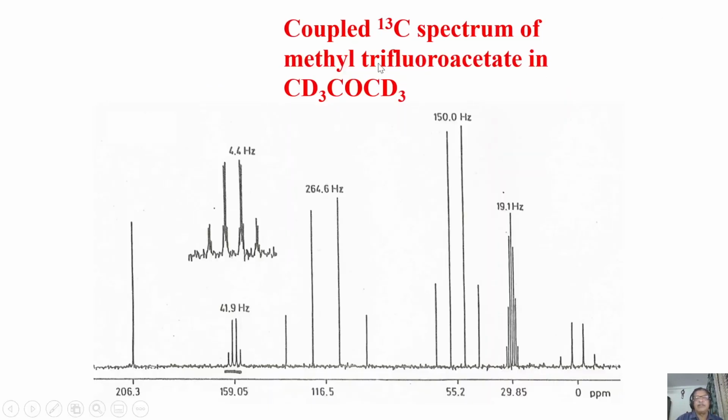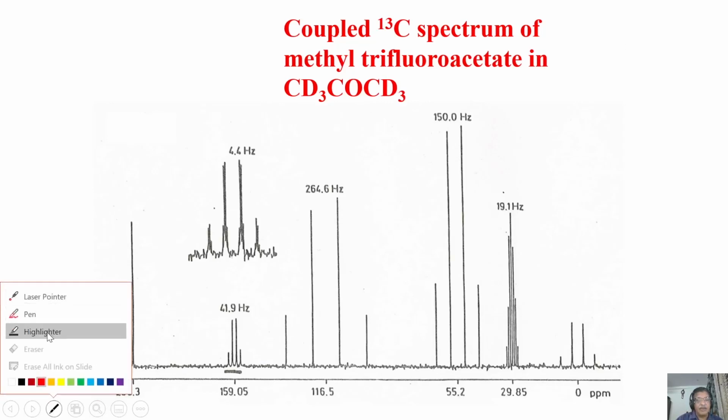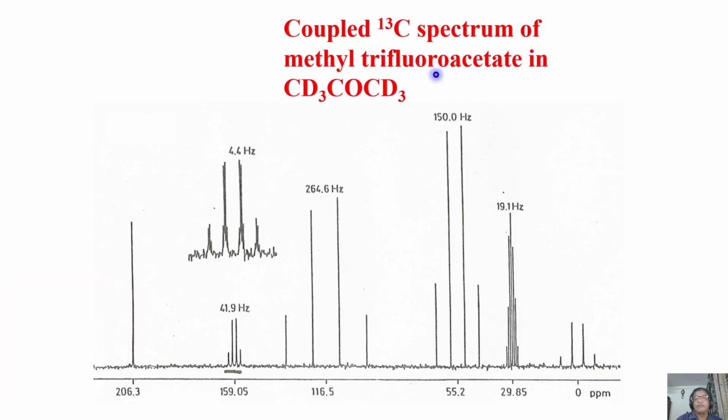This is a coupled carbon 13 spectrum of methyl trifluoroacetate in CD3COCD3. It's a very, very interesting thing. Please remember, now we are talking about coupled carbon 13 spectrum. Let us interpret what this carbon 13 spectrum is. Each and every peak has to be assigned very clearly. How do we go about doing this?